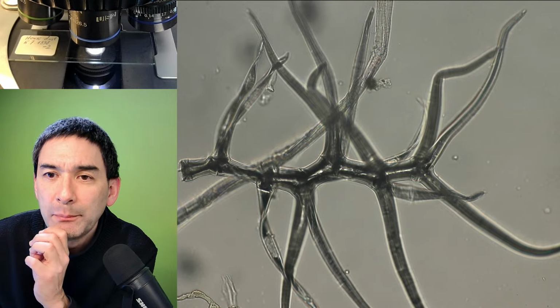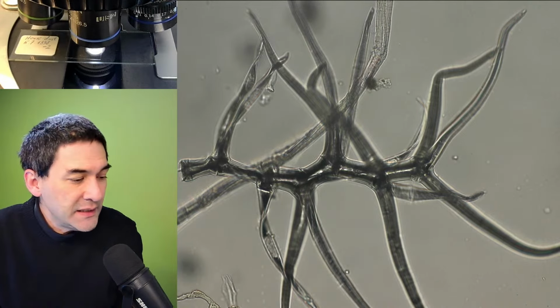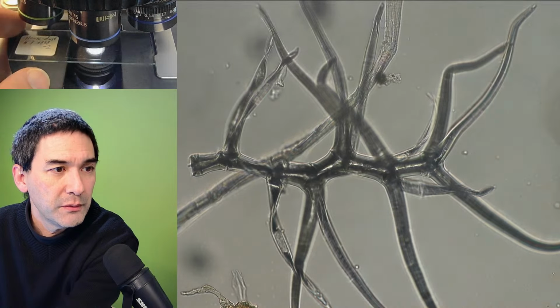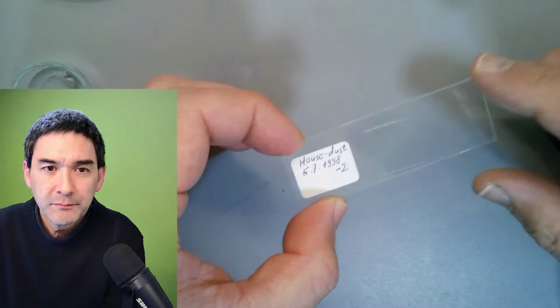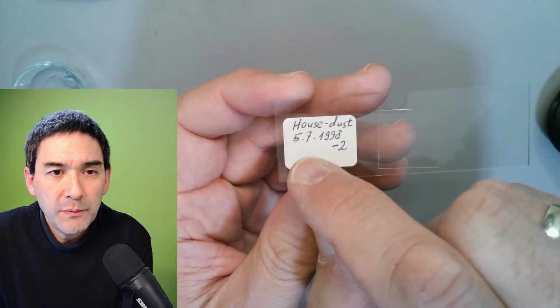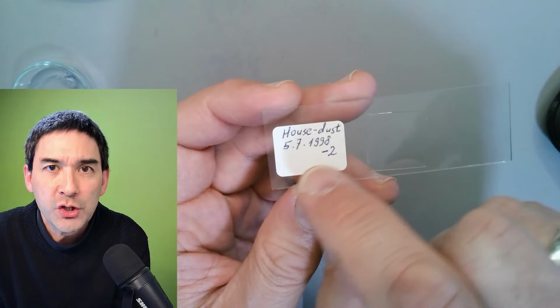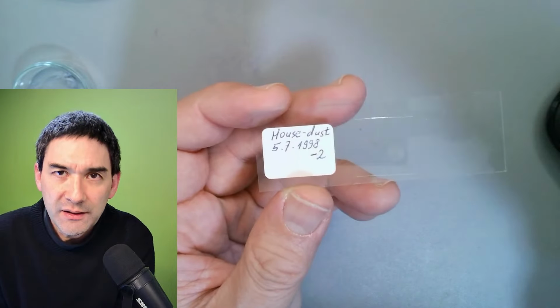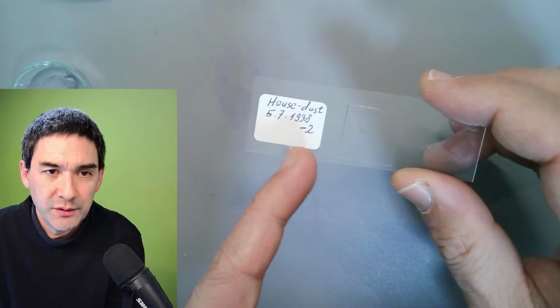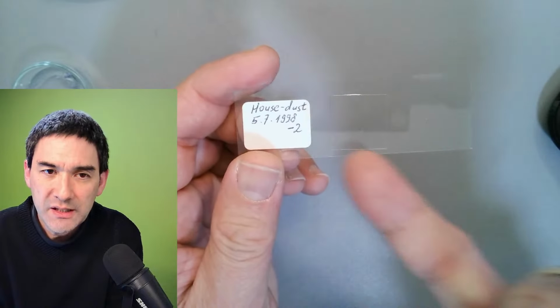Did you make a solid sample of it and describe the slide nicely? So what I've made is the following. Back in the day, in '98, I made a permanently mounted slide. That's the one over here. I used a numbering system, basically with a date, 5th of July, 1998, and then I always gave it -1, -2, -3. It's kind of like a date and a serial number. And when I made the drawing, I wrote down, of course, also the number. Because it's a permanently mounted slide, the specimen is preserved here.